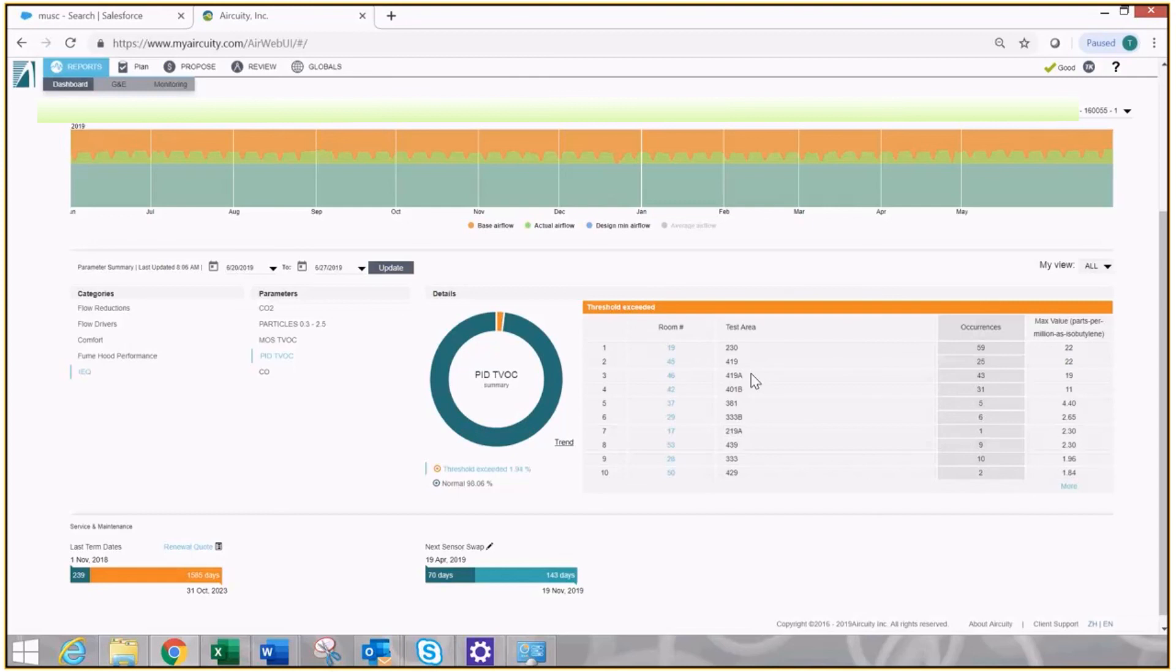There you go. 90 seconds. Stop the watch. Scanned every single room in my entire building, and I've determined out of all of them, which ones need to be fixed this week.